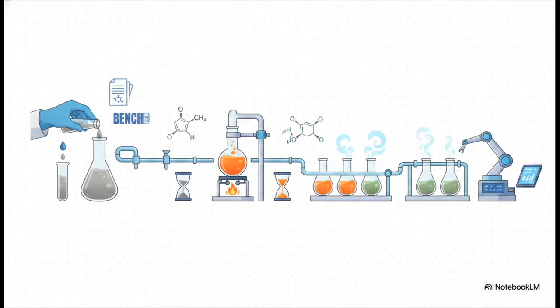If you trace our overall workflow here, you can see exactly how we move from prepping those samples, adding our oxidants and highly acidic catalysts, right through to that high-heat reflux stage. Once those 2 hours are finally up, we have to carefully allow the flask to cool all the way down to room temperature before we can move on to the final analysis phase.